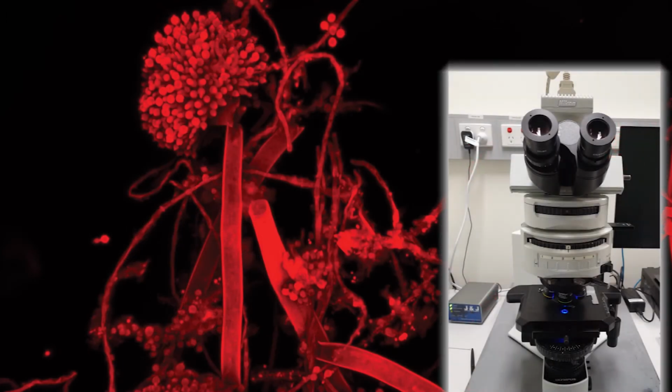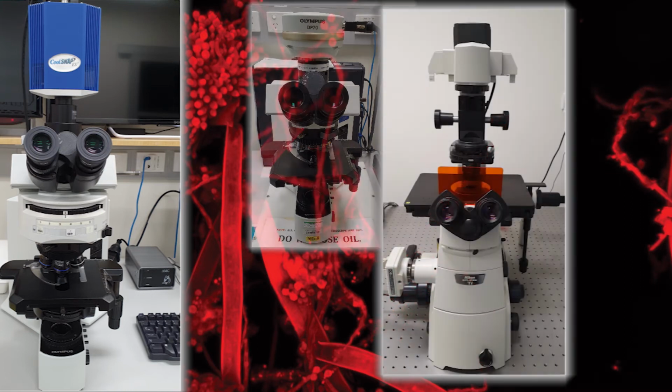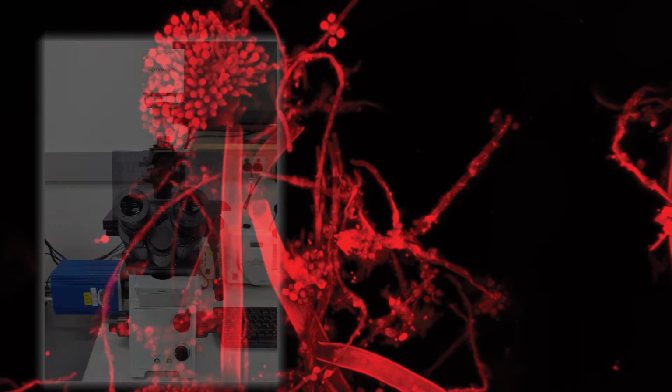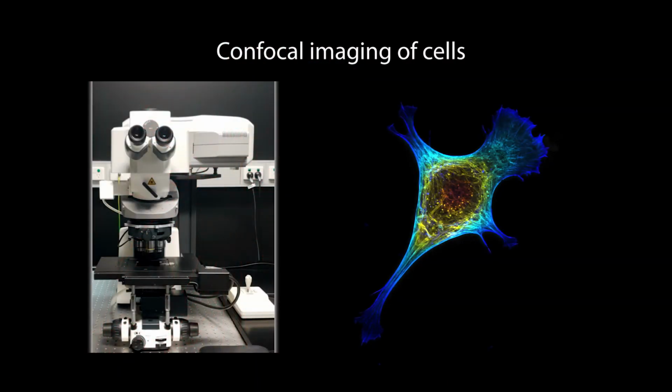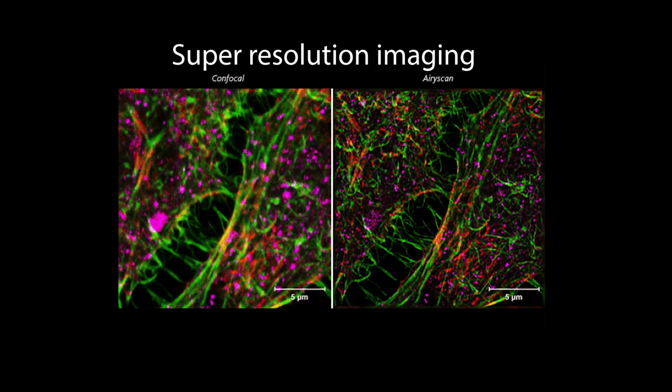After understanding the principles of these microscopy techniques, you will have the knowledge to use 5 of the basic microscopes available to you at IMB. This will then help you to move on to more advanced imaging systems such as the confocal, multiphoton and super resolution imaging systems.